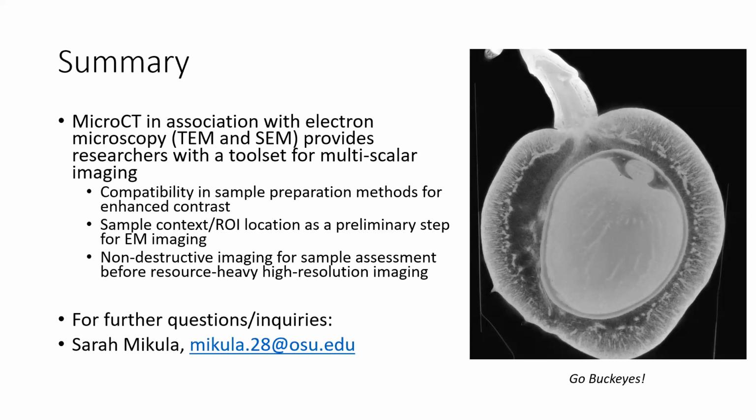Which one, if the sample is smaller, you get better resolution? Thanks, Sarah. Could you repeat the question for those online? Yeah. The question is about how the resolution changes depending on the proximity of the sample to the detector.